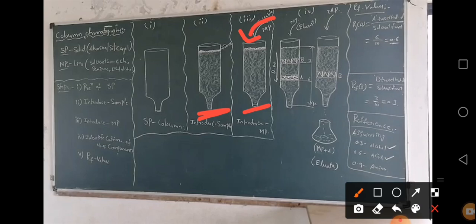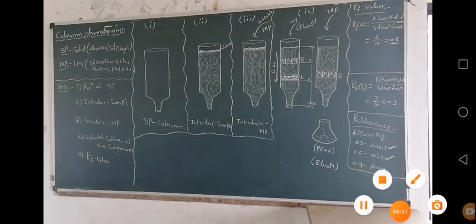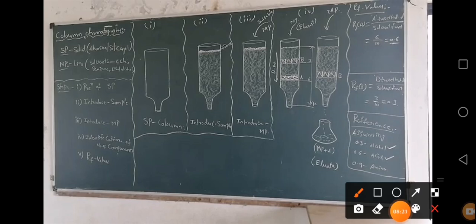While it is moving downwards, whatever components are present in the sample mixture are going to dissolve in the mobile phase.